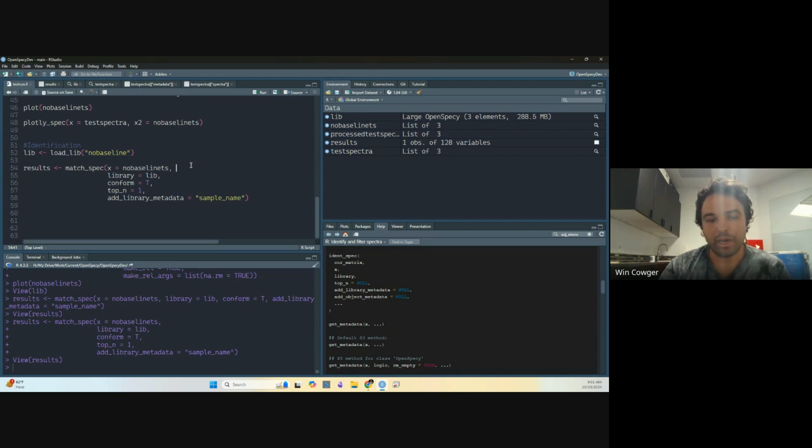Actually, I know where that error message comes from, but it shouldn't pop up for most data sets that you're going to upload. So if it is popping up, then there's probably either an issue with the app or a certain way that the data could be formatted differently so that it gets read in correctly.